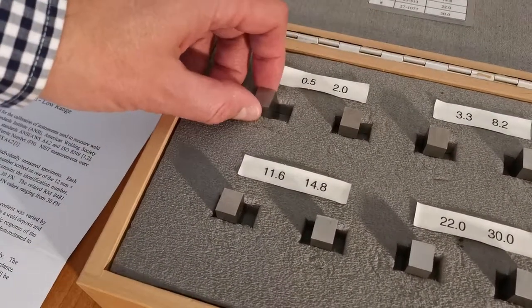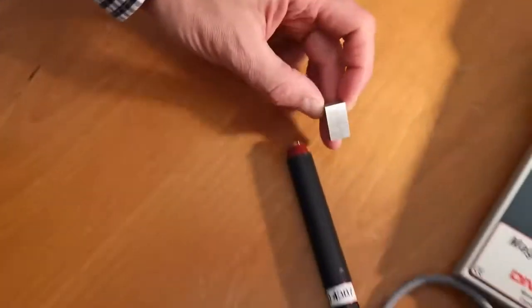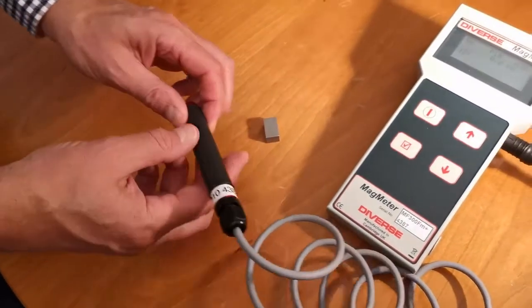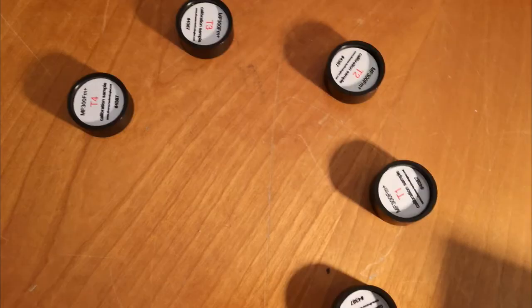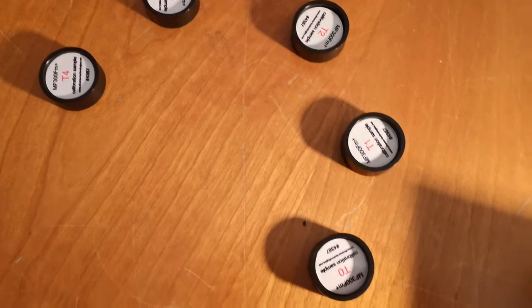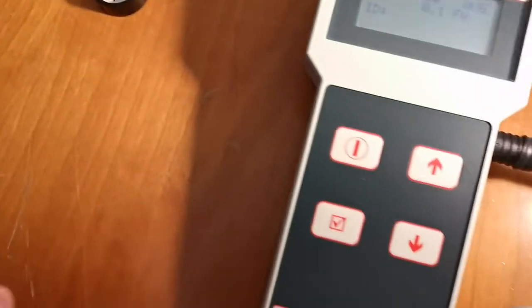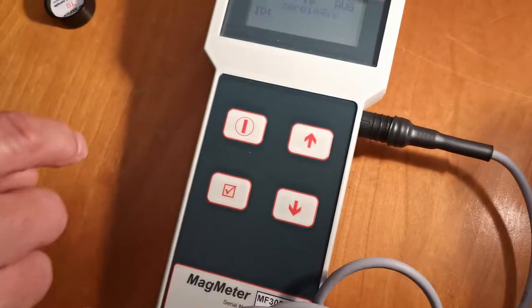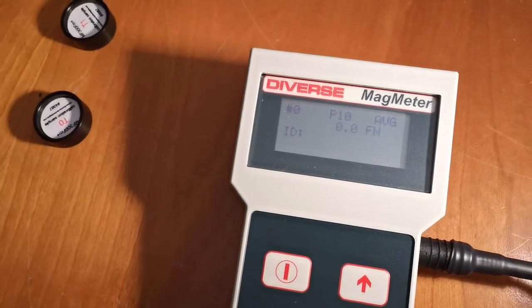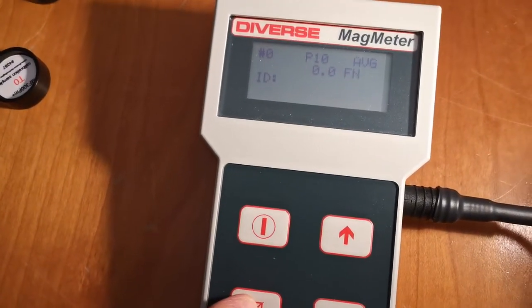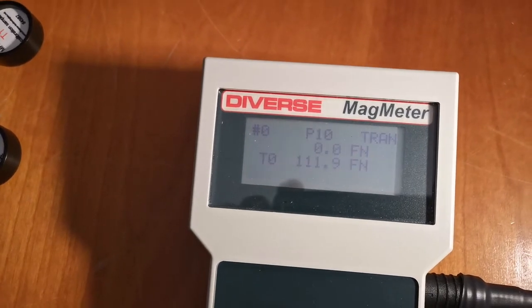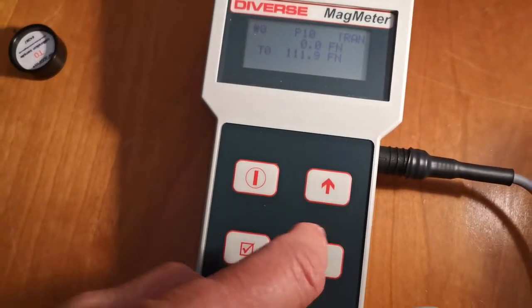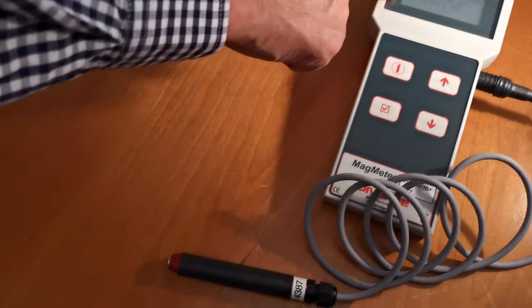Firstly, we'll measure the 0.5FN NIST standard. The instrument is supplied with 5 transfer standards. These are used to check the probe veracity and for user calibration. Here we show the P10 probe being checked with a transfer standard. The values are shown on the calibration sheet and can be displayed on the meter as shown here.